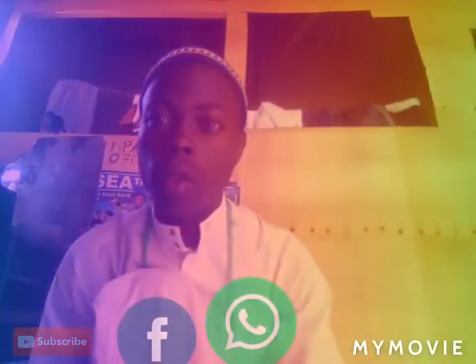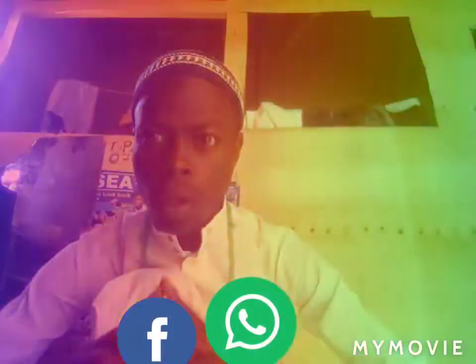I'm here purposely to analyze more about a practical session. This is Chemistry Practical Number 2, all about qualitative analysis. So today, let us talk about one compound consisting of 2 cations and 1 anion, and that common anion is sulfate. So the compound is like this: iron(III) sulfate and aluminium sulfate.